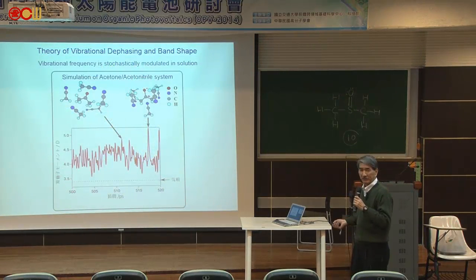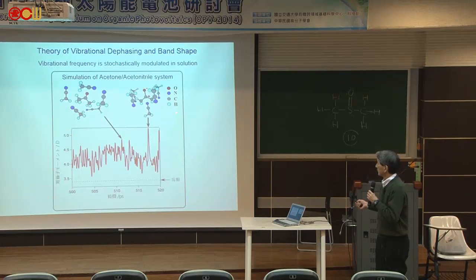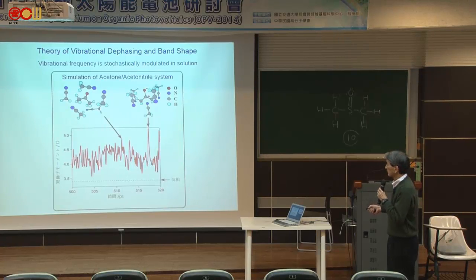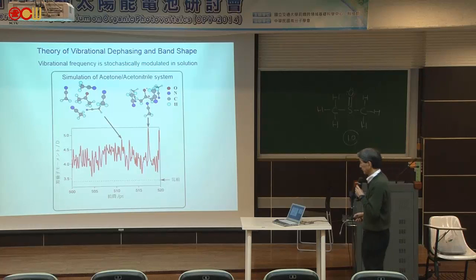So I now come back to this one. This is actually the picture showing the same thing. That's solvent-induced dynamic polarization, and the dipole moment fluctuates like that in a very short time scale, in picoseconds. And that causes the width of your vibrational band.